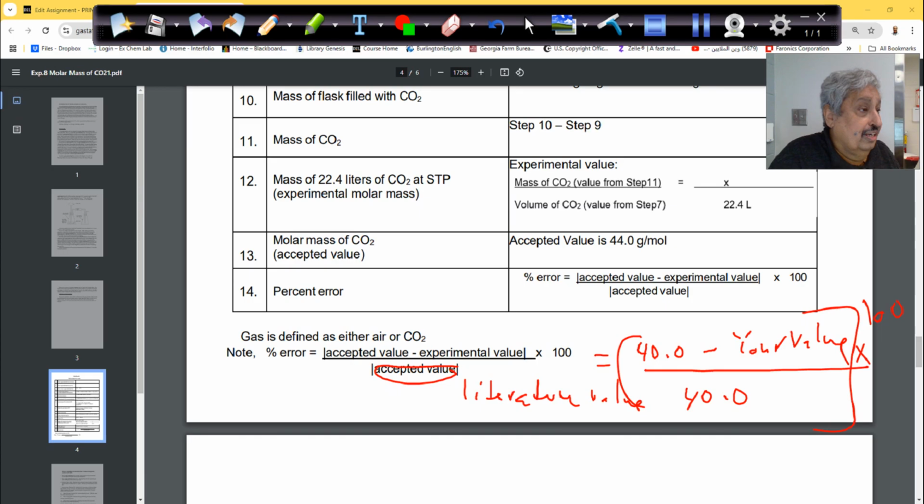So if you get a larger error, that means there was a problem at the beginning of the drying, or in between you talked maybe with your partner a little bit, you forgot, and you let the CO2 escape, and then you get air inside the system, correct? So I think that's really all.